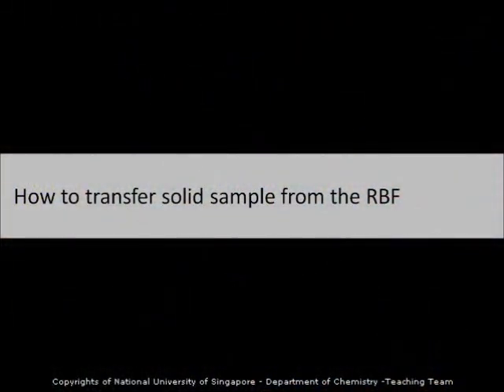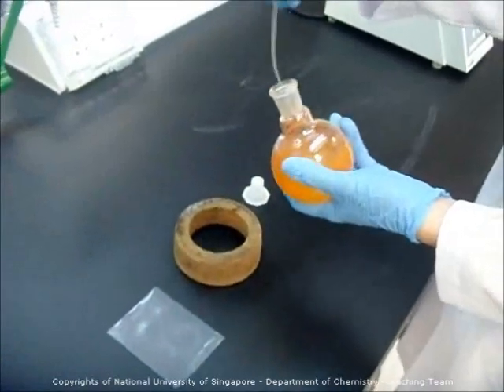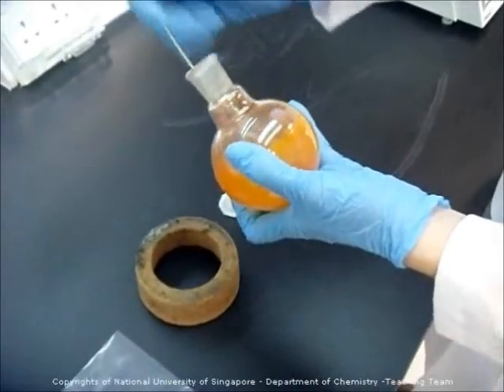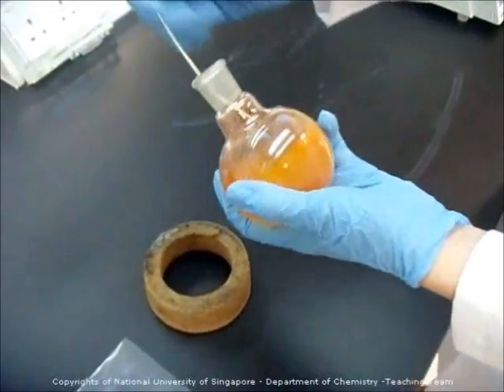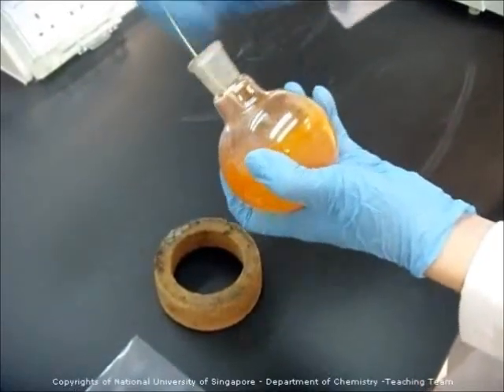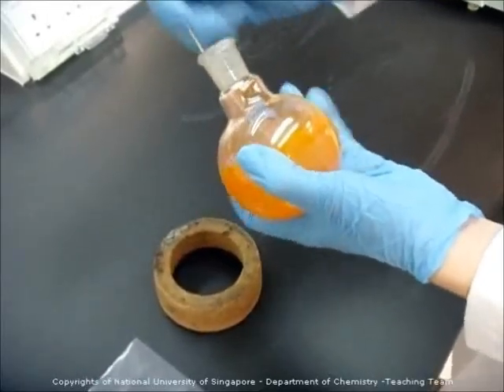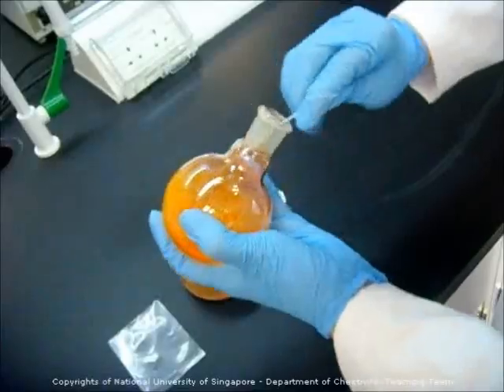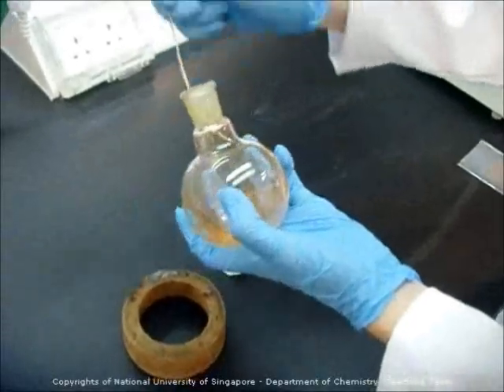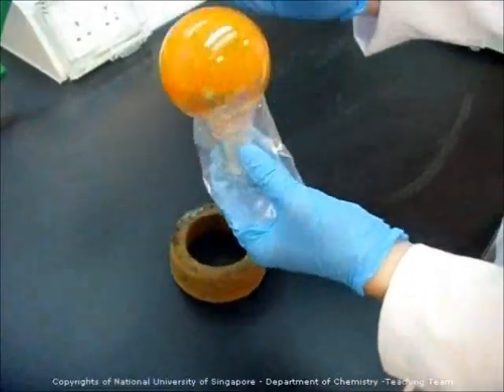Next, I am going to show you how to remove the solid sample from the round bottom flask. You need a flexible metal spatula so that you can bend it and insert it into the round bottom flask. Scrape thoroughly along the inner walls of the round bottom flask to get your solid sample out, then transfer your sample into a small bag.